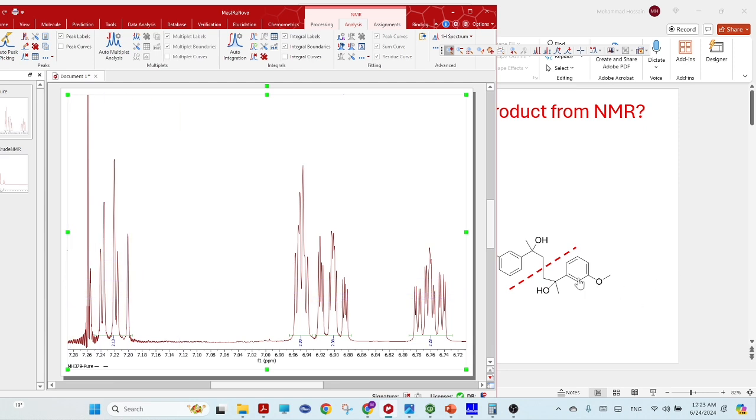Or like you can say triplet of doublet. So it could be this one, this doublet of triplet. And this proton has 2 proton neighbors, so it will show you a triplet, and then it also could be affected by this, but directly a triplet is kind of okay. So this will be this one. So normally it will show a triplet, but that is also split by this proton, so it is there.